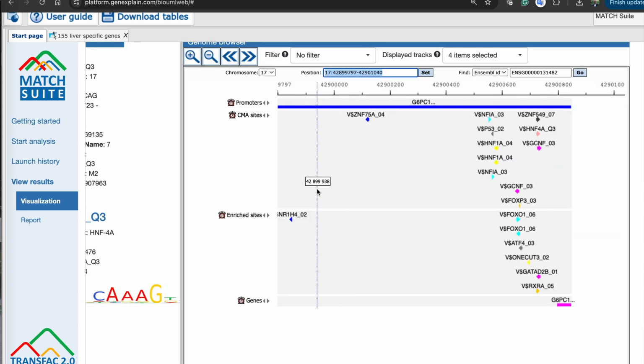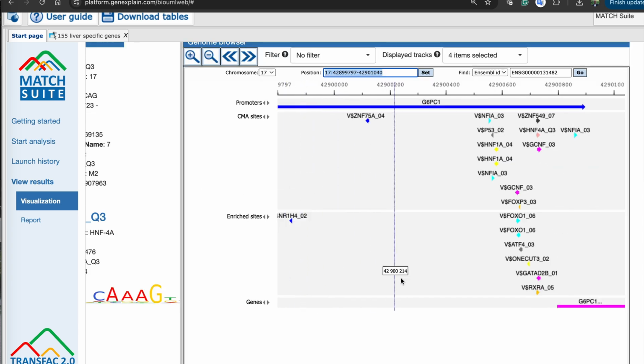We actually ran the site enrichment using 2 algorithms. One is called just a site enrichment algorithm, which gives you enrichment of individual motifs in the promoters of those genes. And another algorithm is called composite module analyst, which is using genetic algorithms and pieces of artificial intelligence. These look for a combination of transcription factor binding sites found in the promoters of those genes. And you see here that HNF1 sites are combined with P53 and also with HNF4 and sites for other factors.